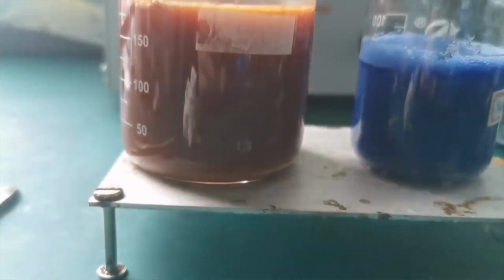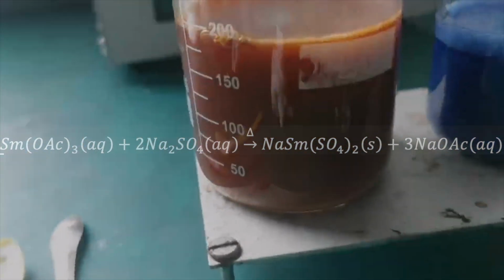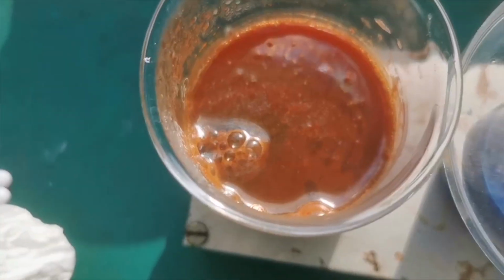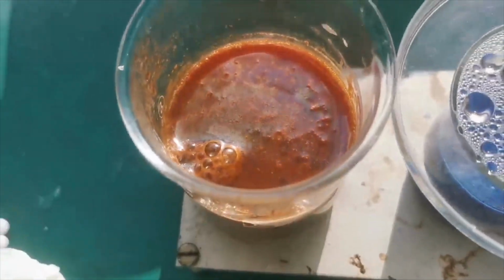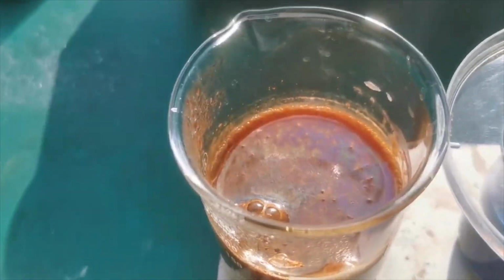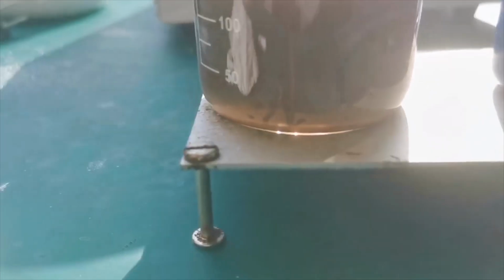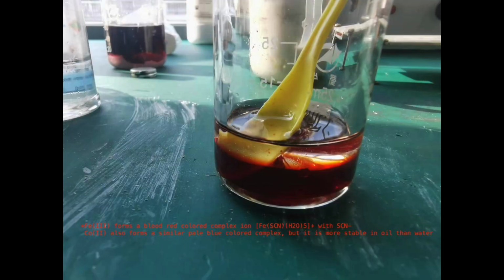The light lanthanide ions, including samarium ions, react with sodium ions and sulfate ions to form an insoluble sulfate double salt. I then continued to boil down the solution to precipitate more of the double salt. However, a brown layer also appeared at the top, and that was certainly not the colorless double salt. I tested the brown stuff by dissolving it in some hydrochloric acid and adding some potassium thiocyanate. The intense blood red color indicates a large amount of iron present.